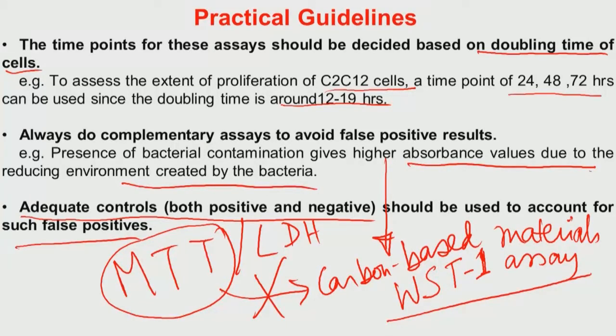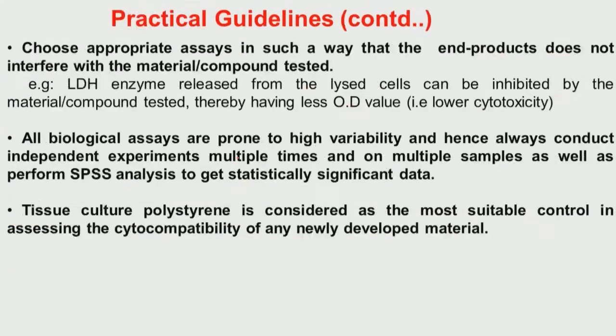Now many times in biomaterials people use the tissue culture polystyrene or tissue culture plastic cover slip as one of the controls where cells normally grow. Now another positive control one can use is hydroxyapatite as such in case of the bioceramic materials, because hydroxyapatite is known to be the most biocompatible and bioactive material, and therefore different cell types can grow very easily on hydroxyapatite based materials.